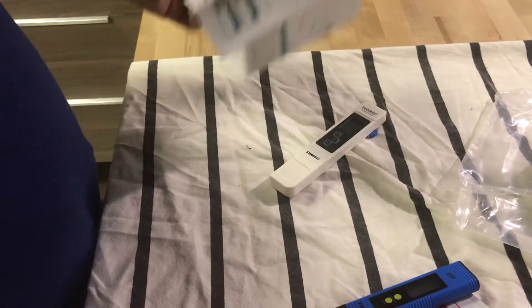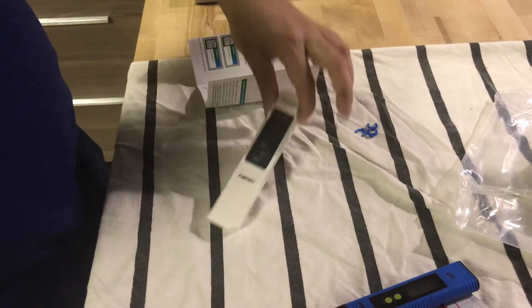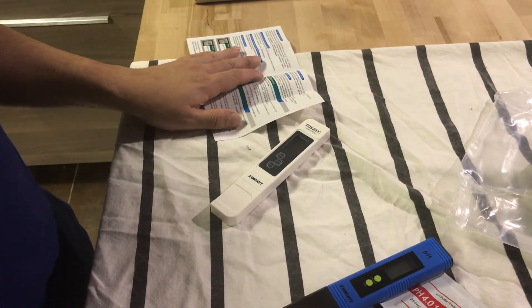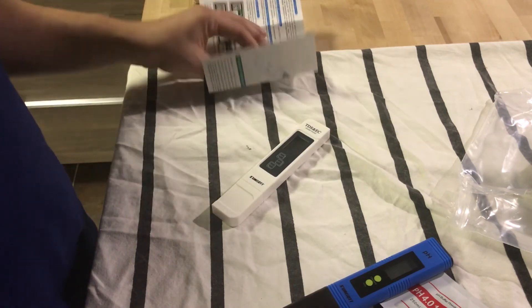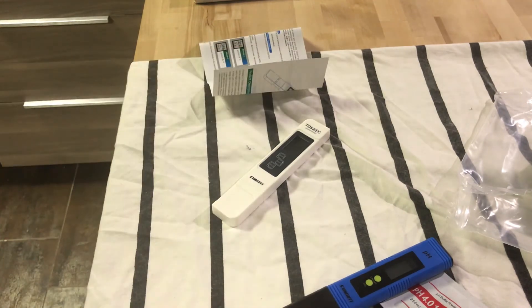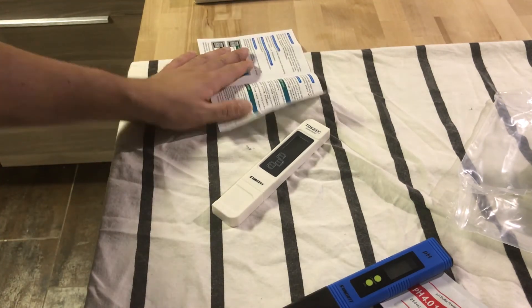So that's just the review of me opening it up so you guys can see exactly what it looks like and what you're getting. Let me read the instructions and get a little more familiar with it, and then I'll be able to give you a better review in the next clip. Thank you everybody.